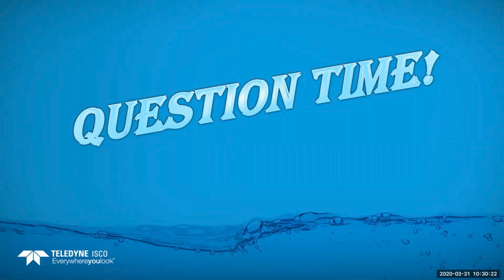Actually, one of our guys here gave me an answer to one of the PFAS questions. It says the PFAS have been found to absorb to glass, especially when the sample is in contact with the glass for a long period of time, being stored in a glass container. If the sample comes into direct contact with the glass for a short period of time, e.g. using a glass container to collect the sample, then transferring the sample to a non-glass bottle, the absorption is minimal. So basically it's just the exposure rate. If you have to use glass, just don't let it sit in the glass very long. So thanks for that, Kelsha.